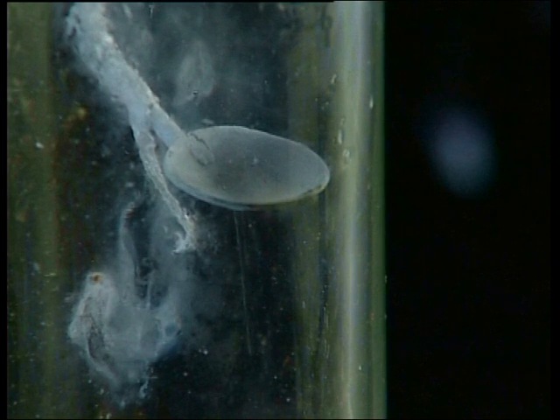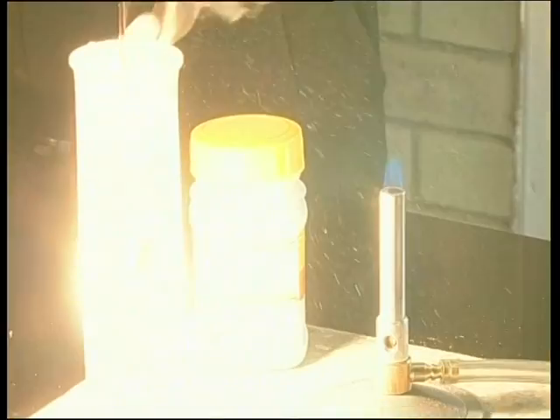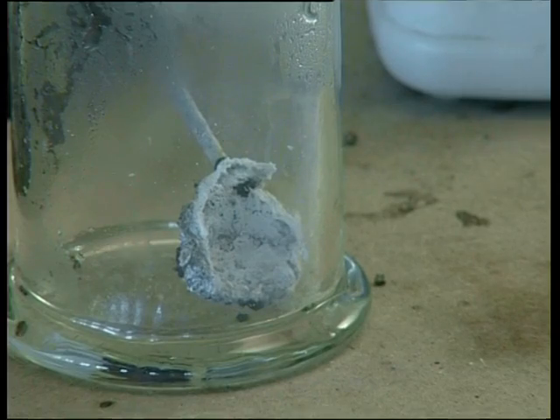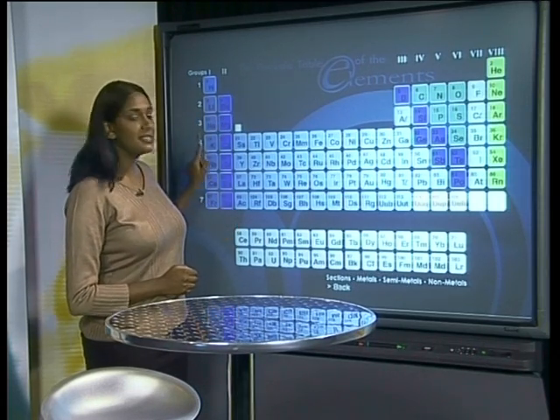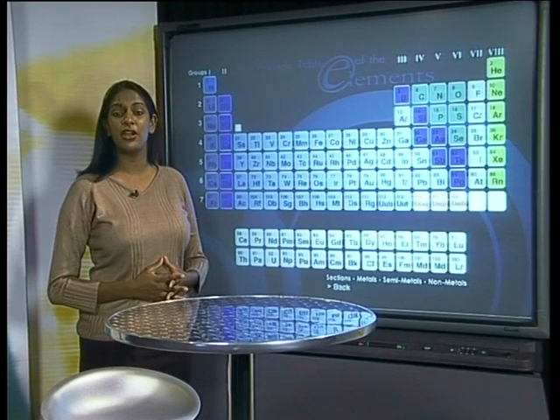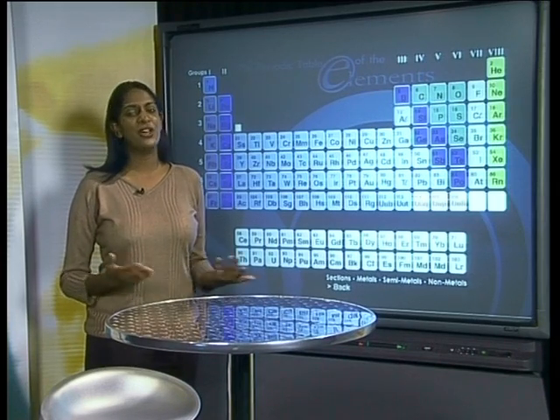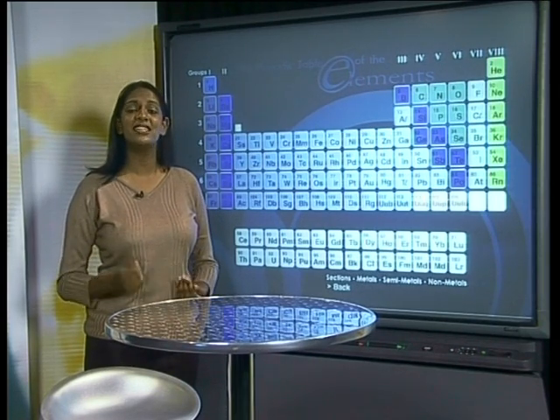Can you see the white powder product called magnesium oxide that forms during the reaction? We need to reserve this product for further testing. Now let's look as this experiment is repeated with a sample of calcium. Notice that calcium burns with a very bright brick red flame when placed in pure oxygen. Calcium oxide is the product that forms during this reaction. This white powder is once again reserved for further testing. I'm sure you can see that calcium is more reactive than magnesium. This means that the lower down a metal element is in its group on the periodic table, the more reactive it is. When we do science experiments, we don't just have fun, but we need to be thinking about what these experiments tell us, so we can draw conclusions and make predictions.